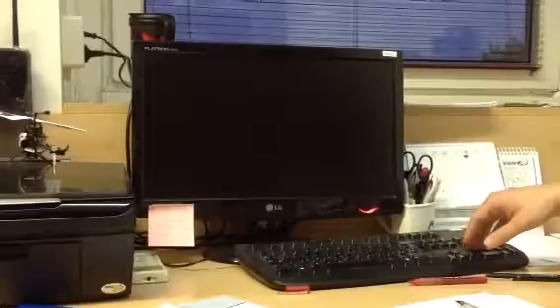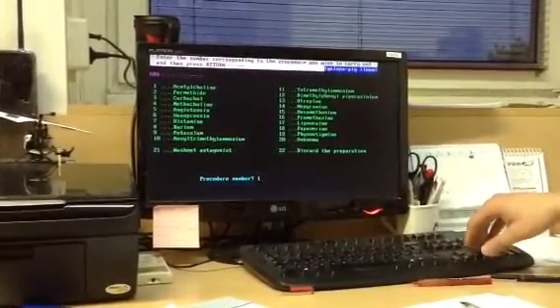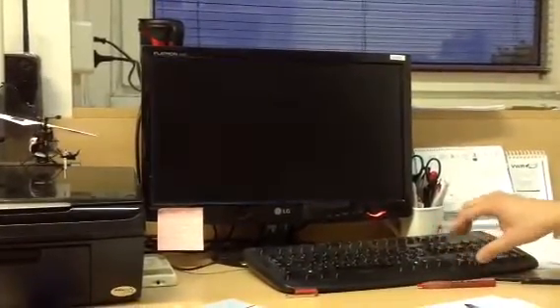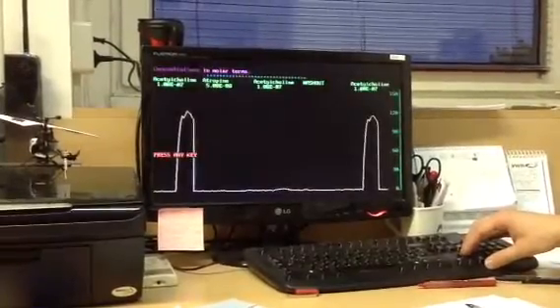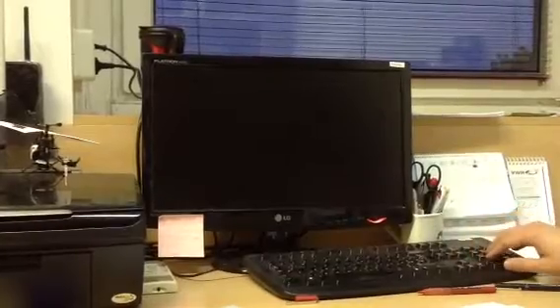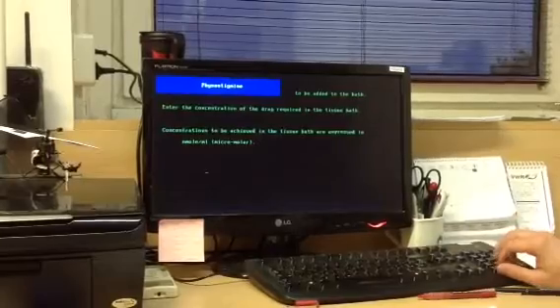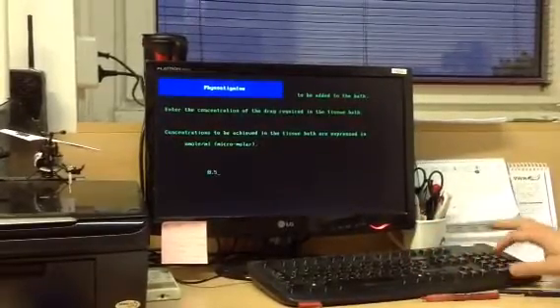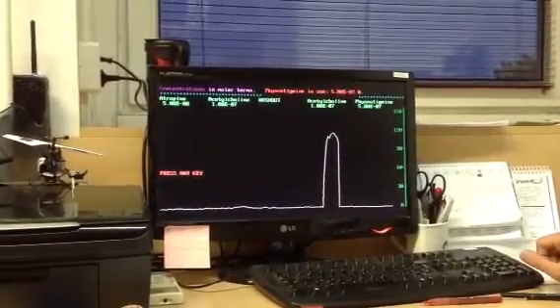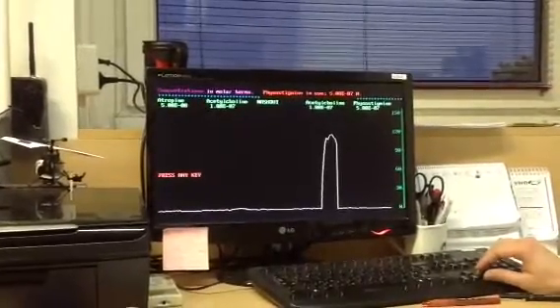Then we do the same thing. Use acetylcholine at first to have something to compare to. Acetylcholine, 0.1. It causes the same contraction. Then use physostigmine, 19, and the concentration is 0.5. As you can see, it has no real effect alone.